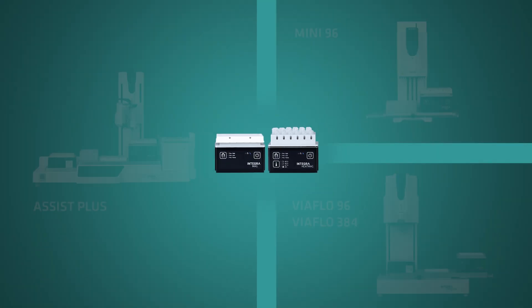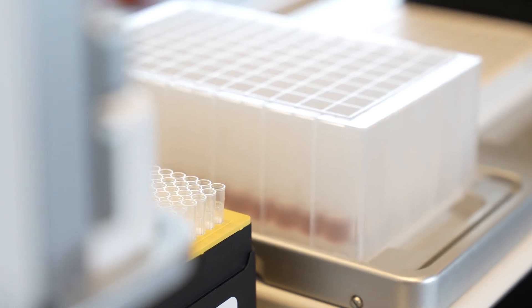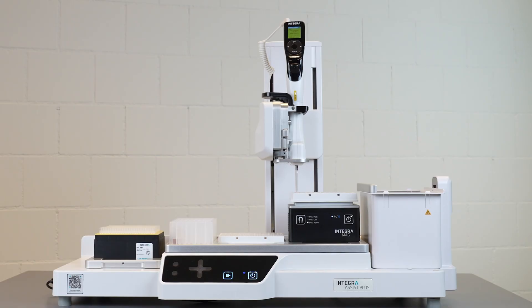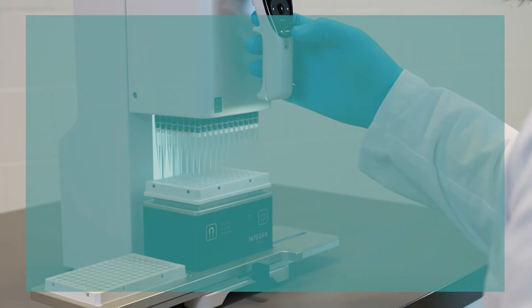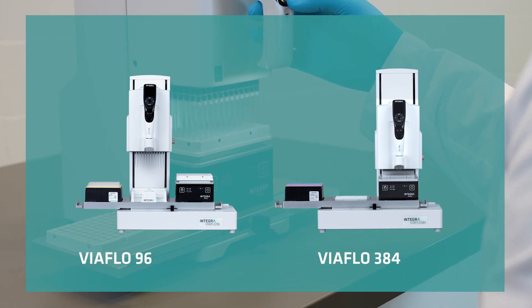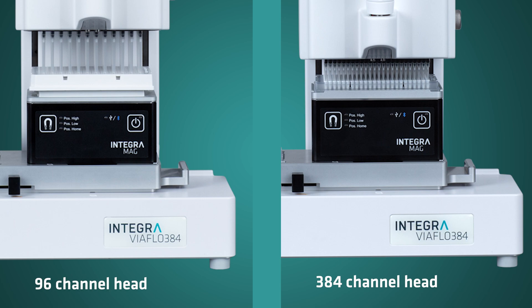Mag Modules can be used as standalone units or seamlessly integrated with INTEGRA's pipetting solutions. You can choose to combine the Mag Modules with the ASSIST PLUS pipetting robot for fully automated walk-away magnetic bead purifications, or with the MINI 96, VIAFLO 96, and VIAFLO 384 electronic pipettes for high-throughput liquid handling, processing 96 or even 384 samples in one go.